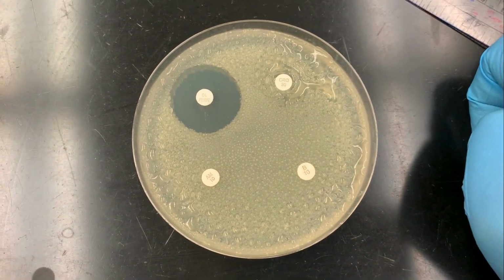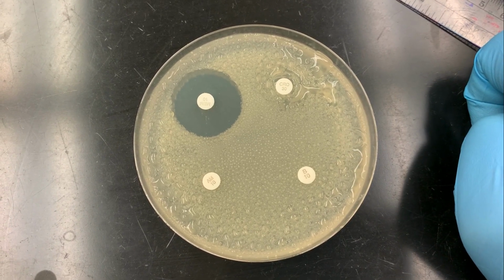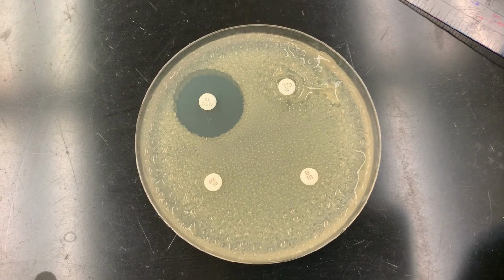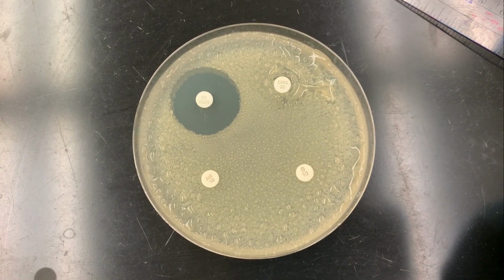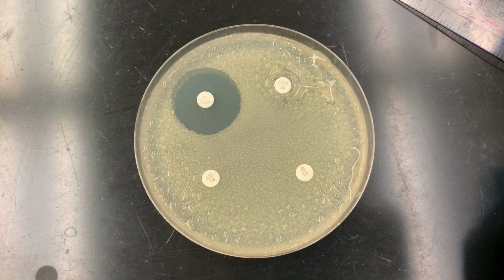So what I will show you next is how to interpret the zones of inhibition. So remember, ampicillin, bacitracin, ceftriaxone have 0 inhibition. Meropenem, 25 millimeters.